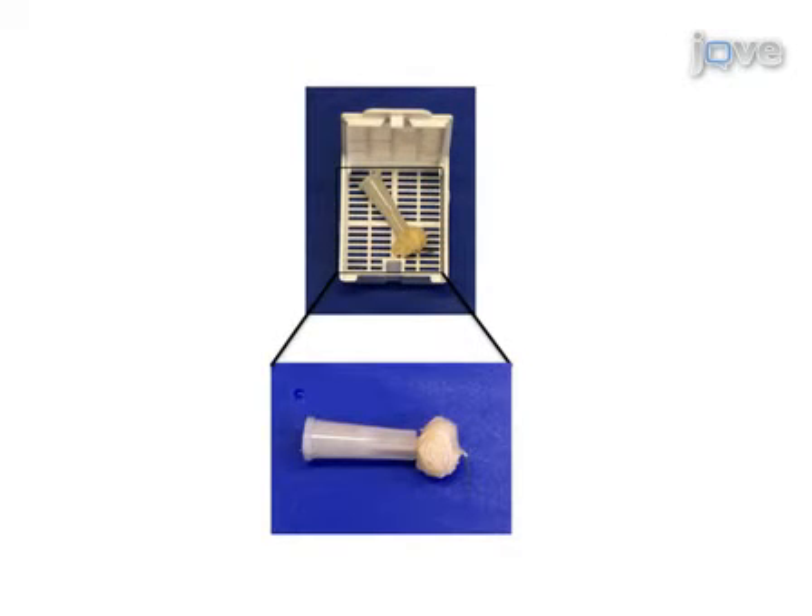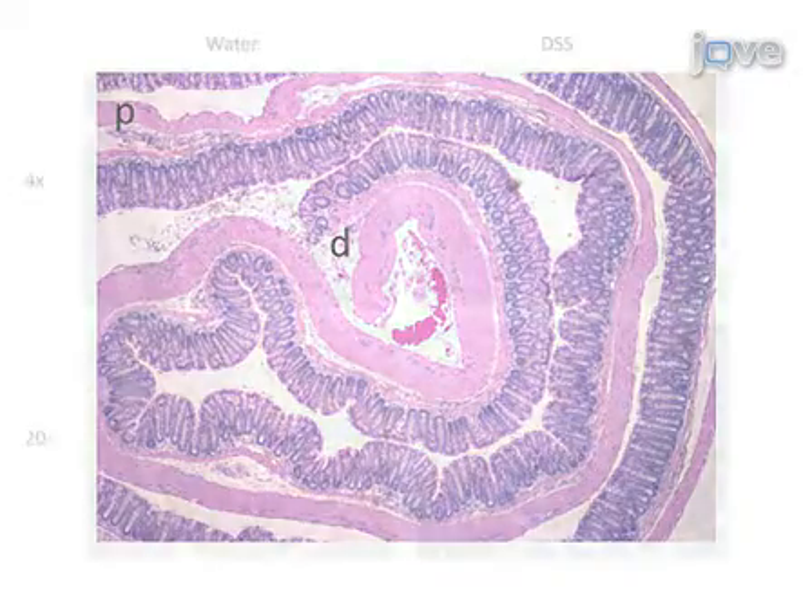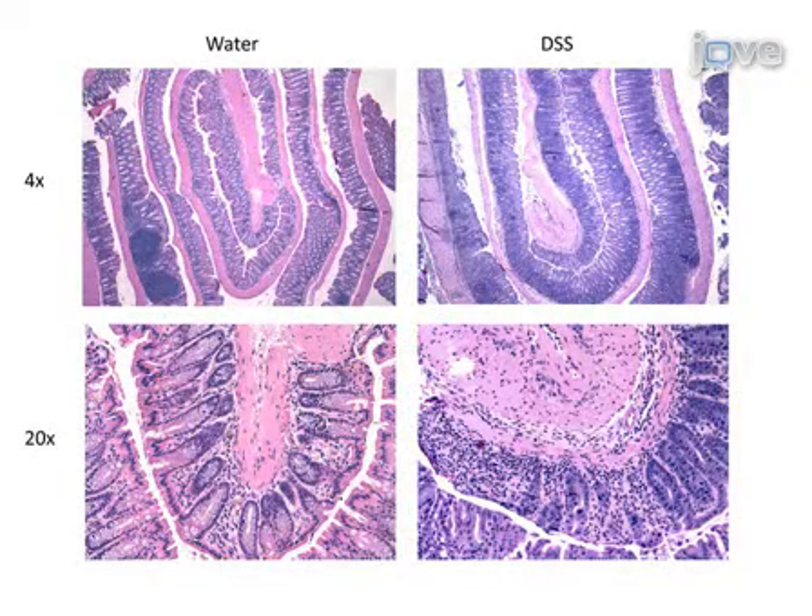For histological analysis, the colon can be processed as a Swiss roll. The roll is secured with a needle and placed in a tissue cassette for fixation. When the roll is cut and mounted, it should form a representative slice of the entire colon, if rolled properly. Sections of the Swiss roll can be stained with hematoxylin and eosin in order to determine the extent of colonic injury, remembering that the distal end of the colon is in the center of the roll on the slide. In this example, inflammation and crypt damage are apparent in the DSS-treated colon, compared to a water-treated control.